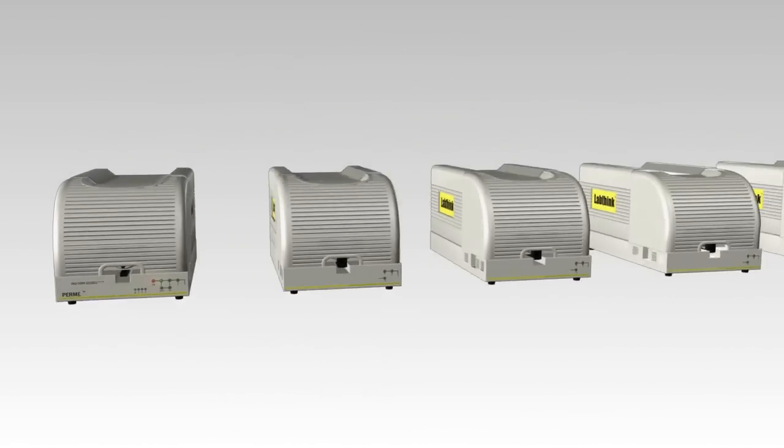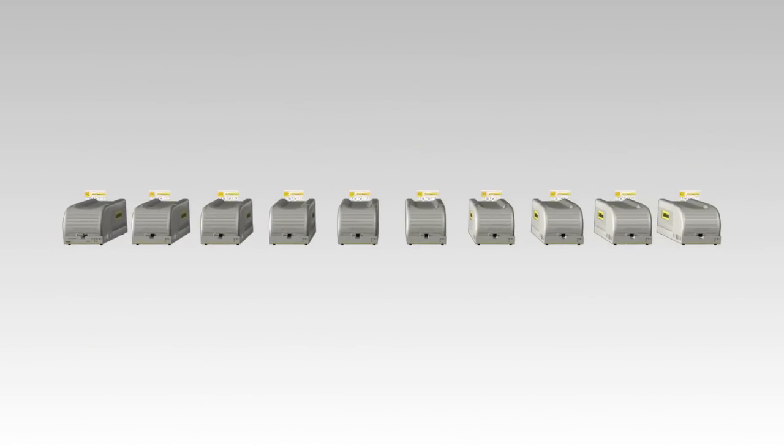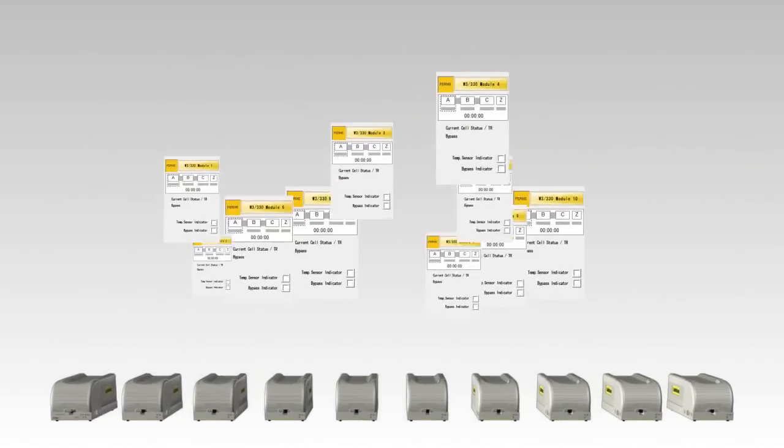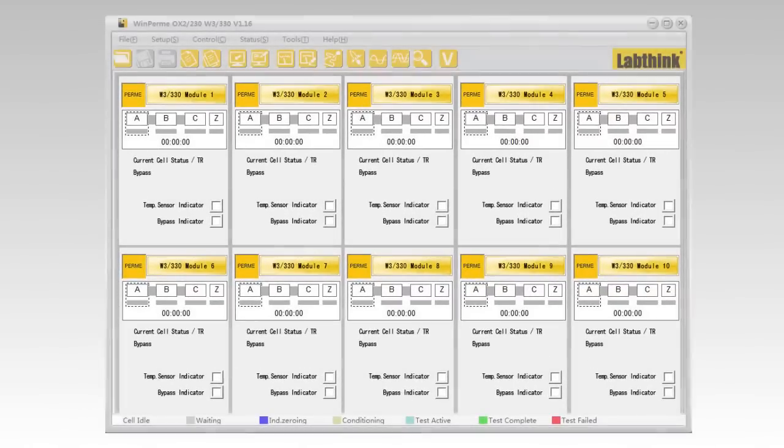One master base can be easily connected to a maximum of nine satellite modules to accomplish up to 30 tests at the same time.